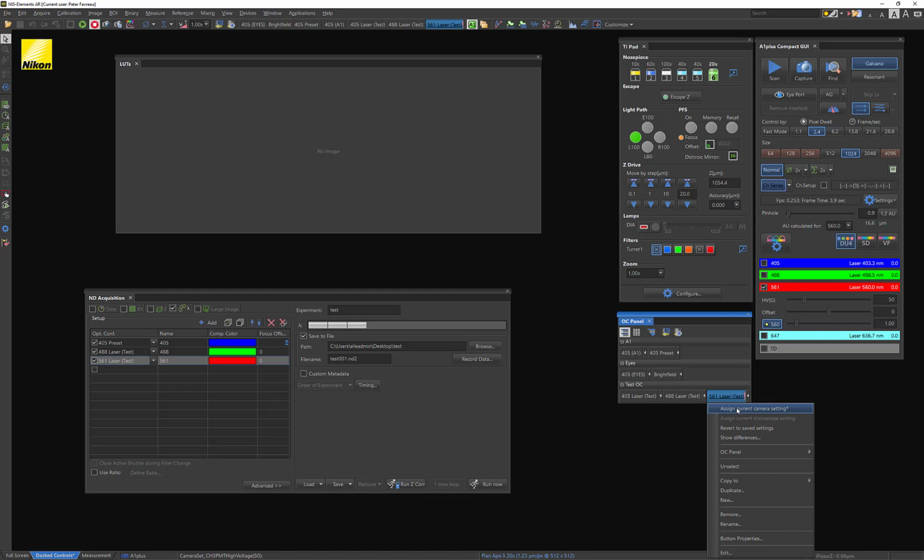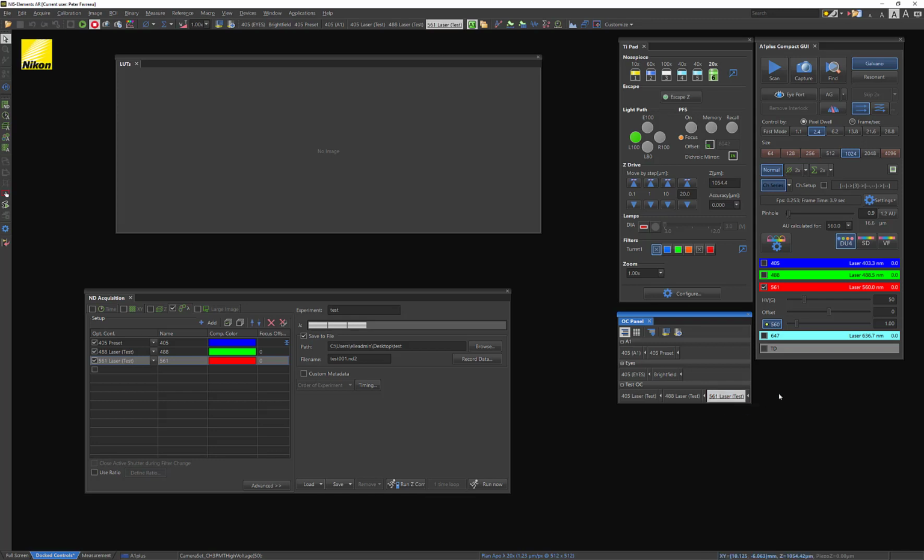And I believe this is the best way to go about working with optical configurations, where it prompts you every single time you make a change, so you can ask yourself and confirm that that's actually the setting you want to use for your optical configuration. I think this will reduce a lot of headaches most users have when working with these guys.